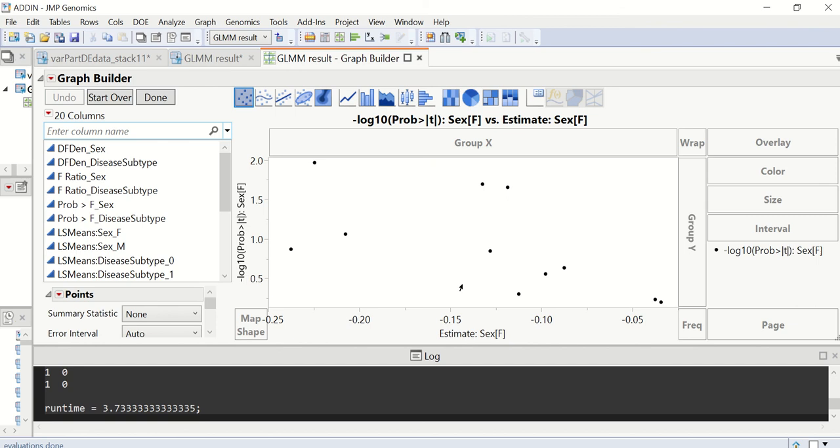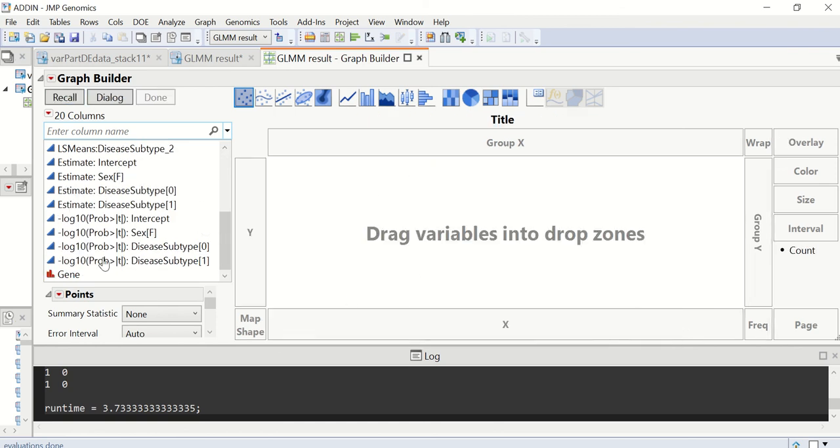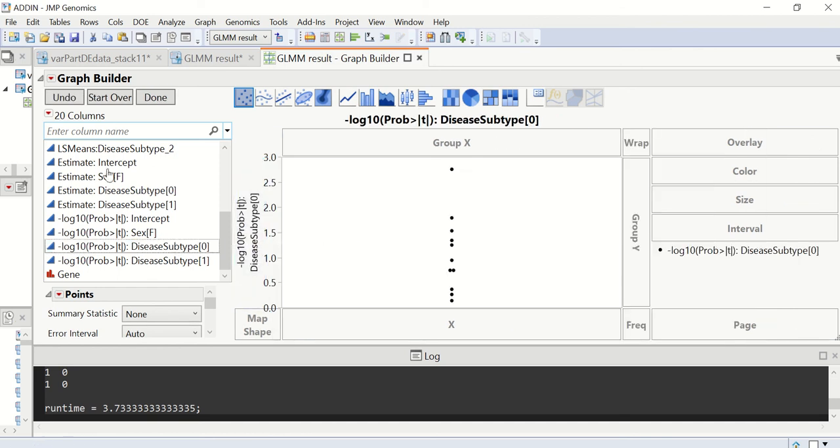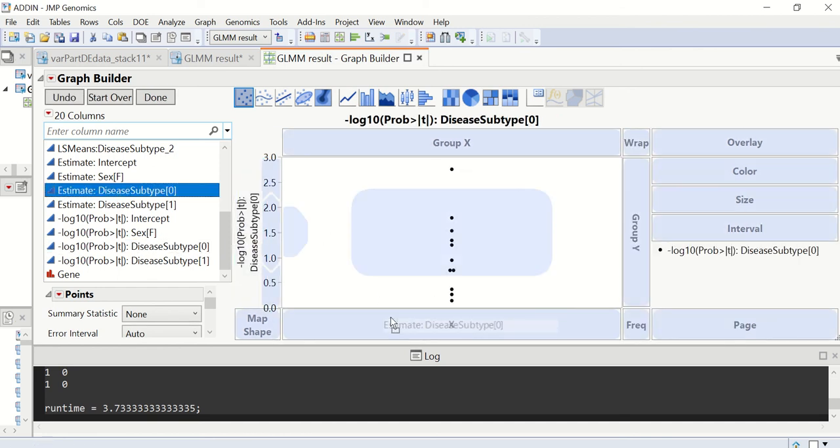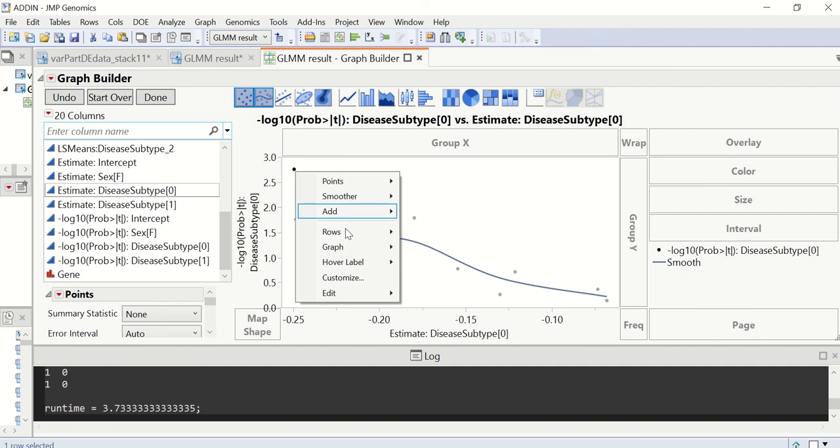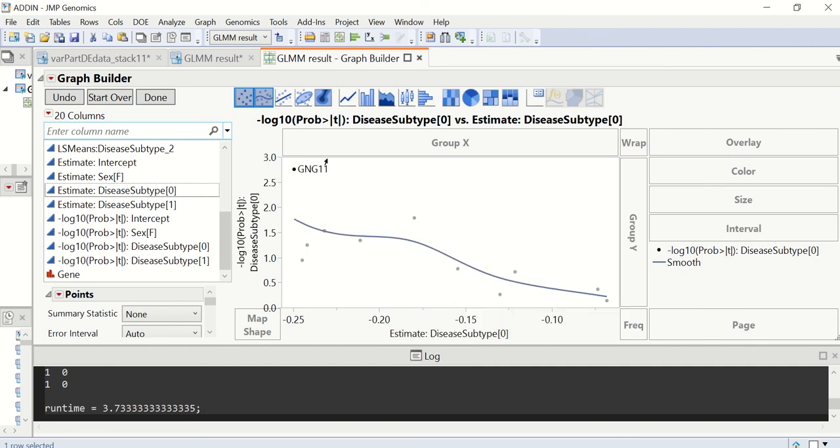And we can easily look at other variables of interest by just dragging the variables to the graph builder. In this way, we can easily report the genes of interest and terms of interest.